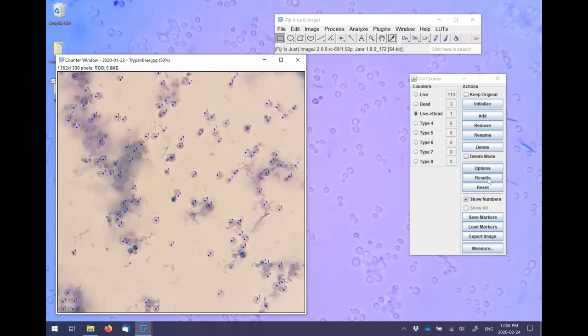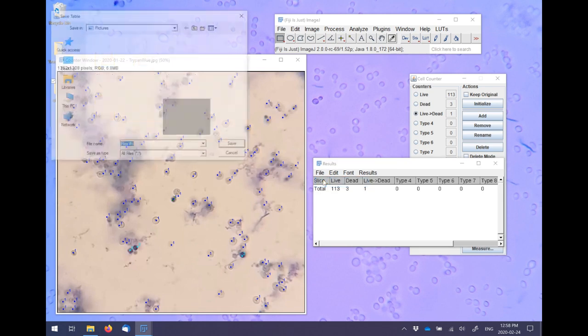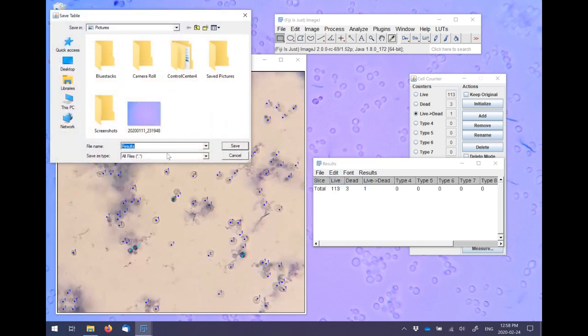When you're done counting click results, the results can then be copied into Excel or another program or even just saved as a comma separated value table. As with the images, these results files can be stored as part of your permanent record.